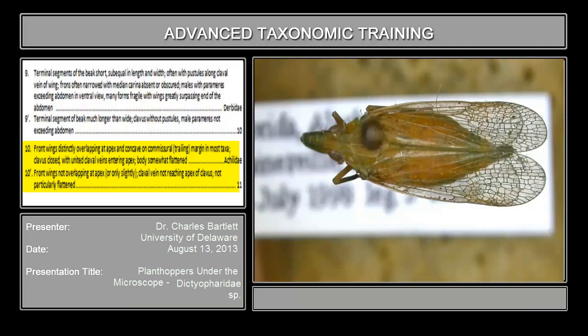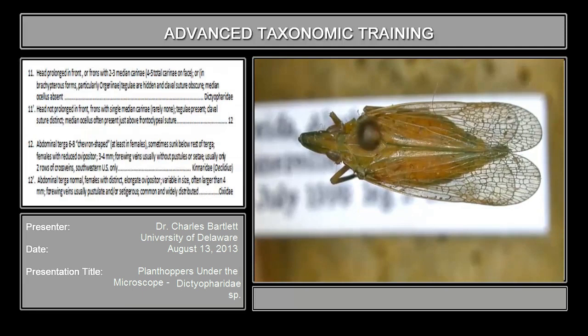Couplet 10 asks about the wings being distinctly overlapping at the apex — something we've already seen. Let me orient it differently. Right in here — these forewings are not overlapping; there's the separation. So these wings are not overlapping, it is not an Acylidae. Move on.